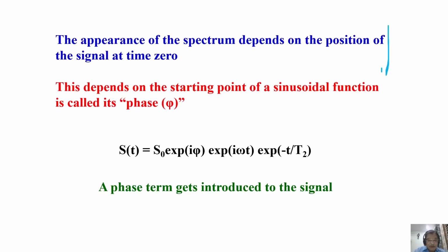Remember, I am going to apply a radio frequency pulse and bring the magnetization here. Instantaneously, the spin vectors, all of them, are in coherence. I have to start collecting the signal immediately without any time lapse. If there is a time lapse, what happens? Some problems of phases will come into the picture.